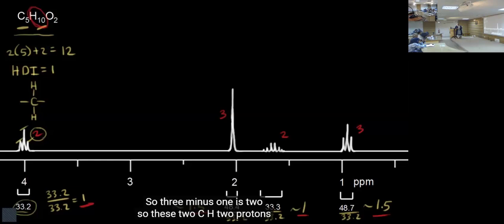First, go to the proton at 1 ppm. These are 3 protons, 2 neighbors. Looking at this, I request Hani to come forward to the board and draw whatever constituent you are observing.